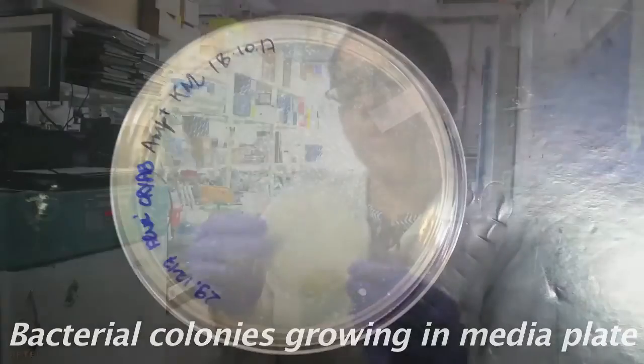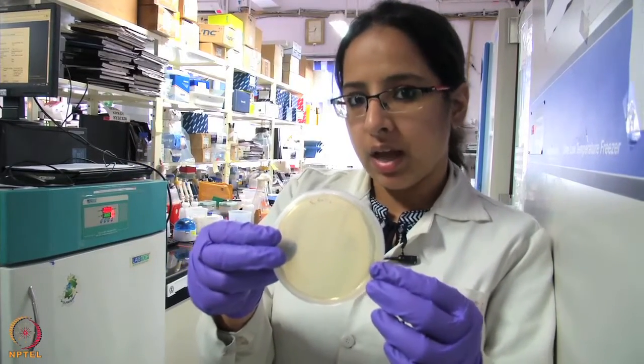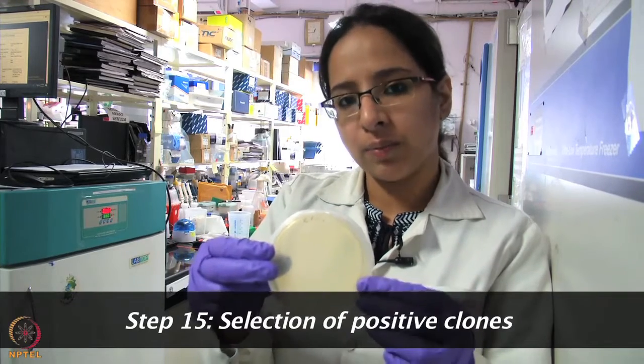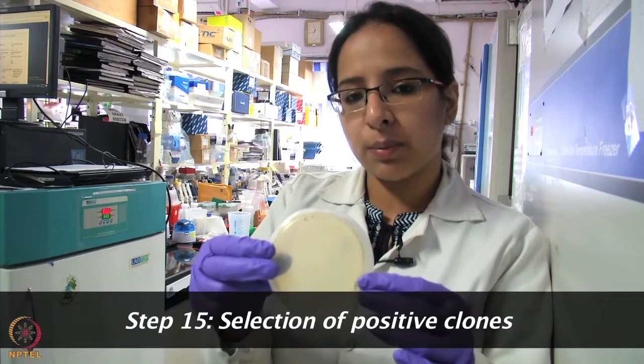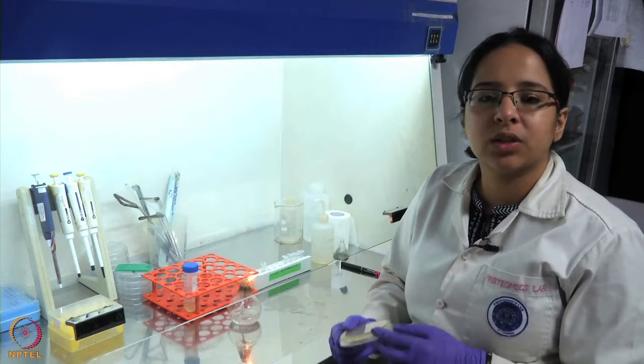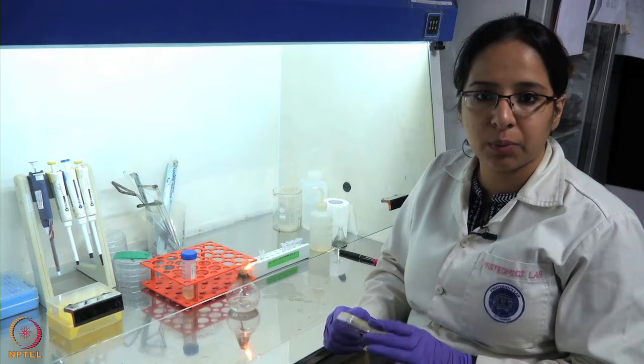So right now we have kept two plates. In one we hope that we have a good transformation efficiency, and in the second plate we should expect it to be blank because that is just water, to ensure that our experiments are absolutely fine and there is no contamination. So once we obtain the colonies, we need to be sure whether these colonies reflect our true recombinant molecule.